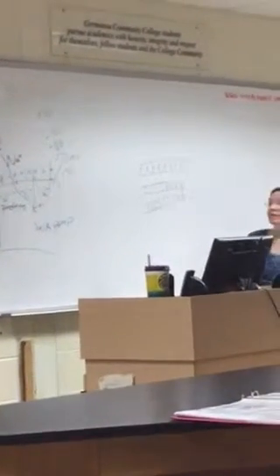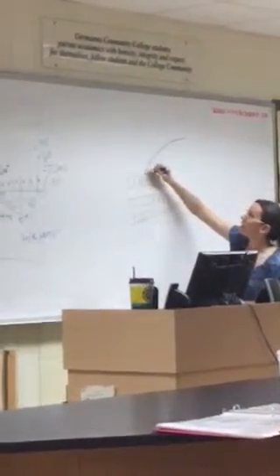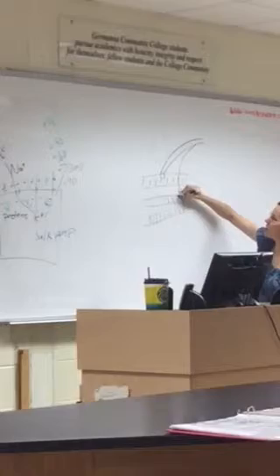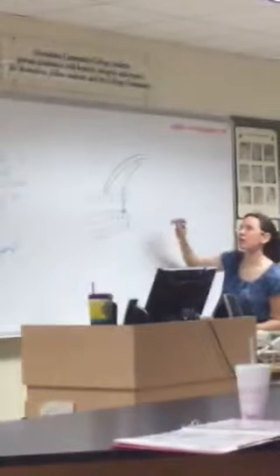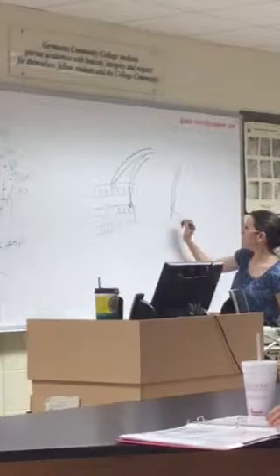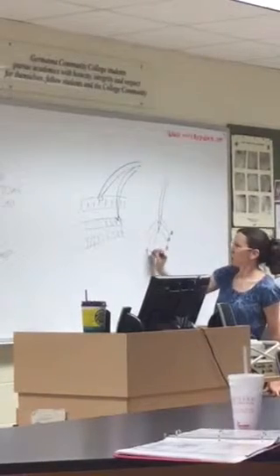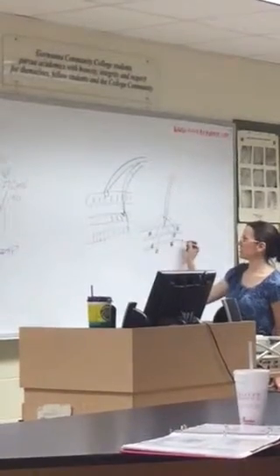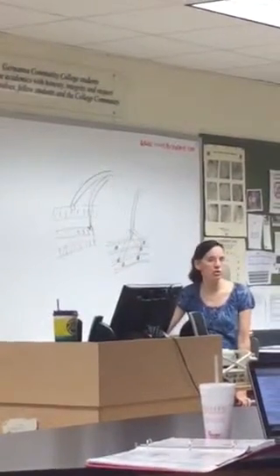And then you're going to have a nerve come in here. There's going to be a little expanded end here, and then it's also going to have another little branch to go over here, a little expanded end, and there's going to be several of those. Actually, I think the slide looks more like one coming in like this, and then lots of branches coming off of it with little, almost like little buttons on the end, and then your skeletal muscle fiber overlying it this way. Okay. So this is kind of what the slide of your neuromuscular junction is going to look like.